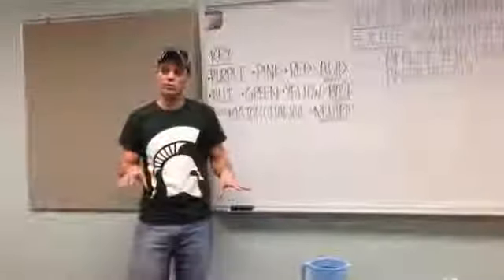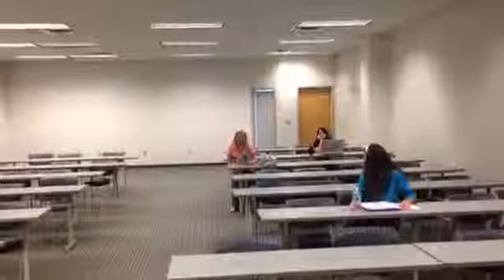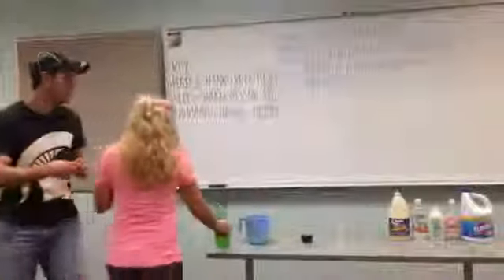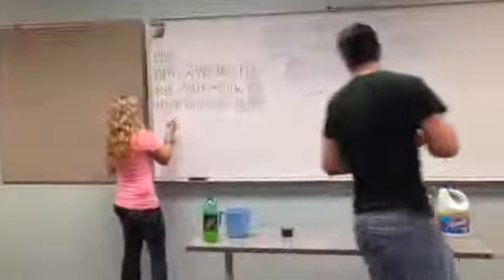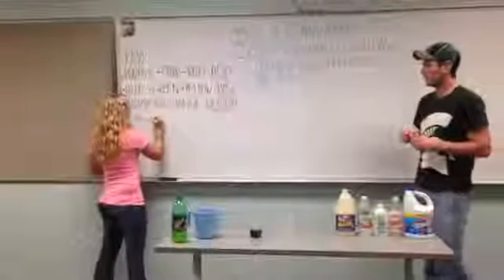Now, are there any questions before we move on? You back there, Goldilocks. I have Mountain Dew with me, and I'm pretty sure it's an acid. Can I try that out with the indicator water? Well, why don't you come up and write your question on the board and go ahead and try that. Thank you. Now, what's the question you're asking again? My question is going to be, how does adding Mountain Dew affect the indicator?